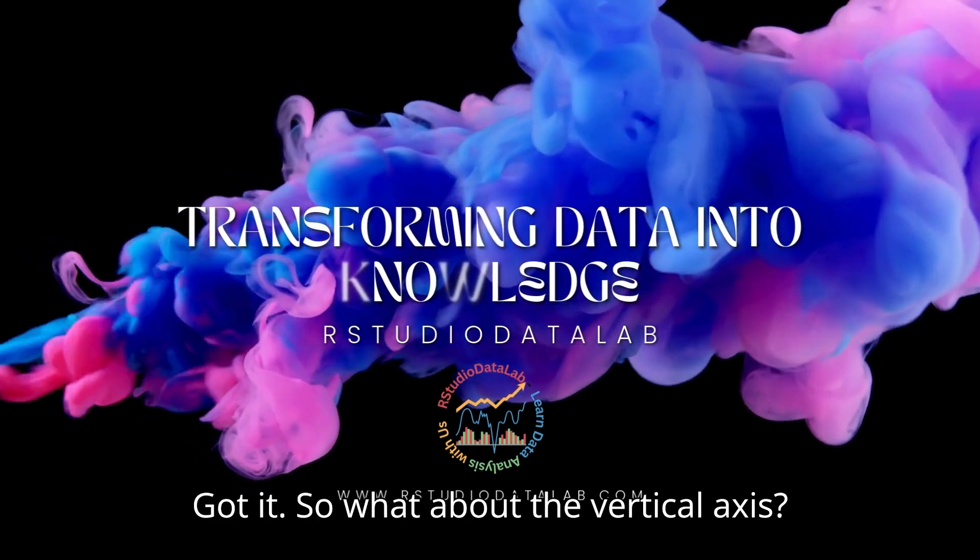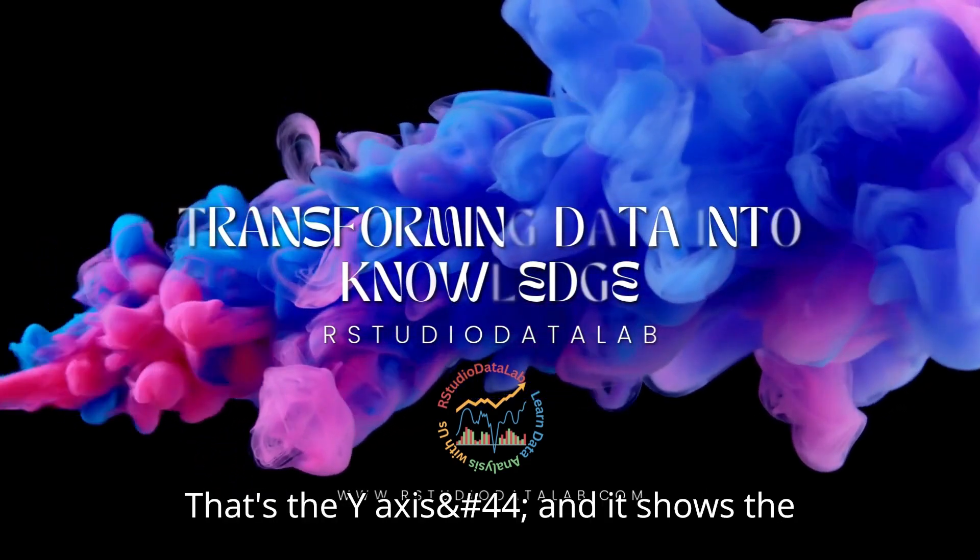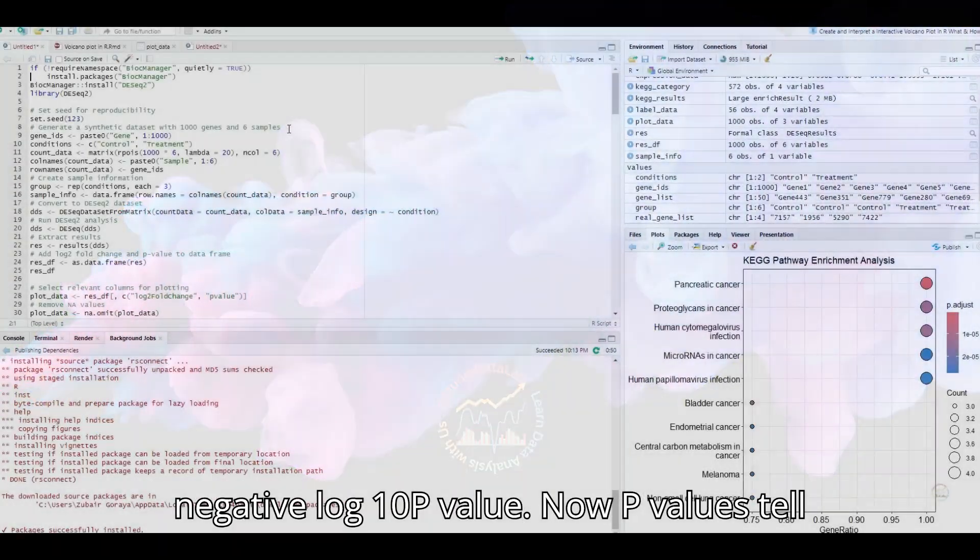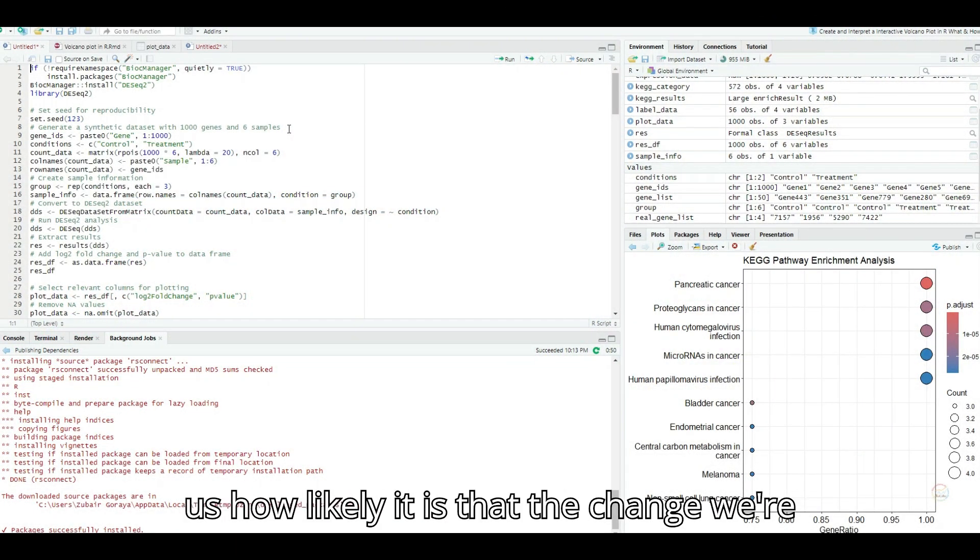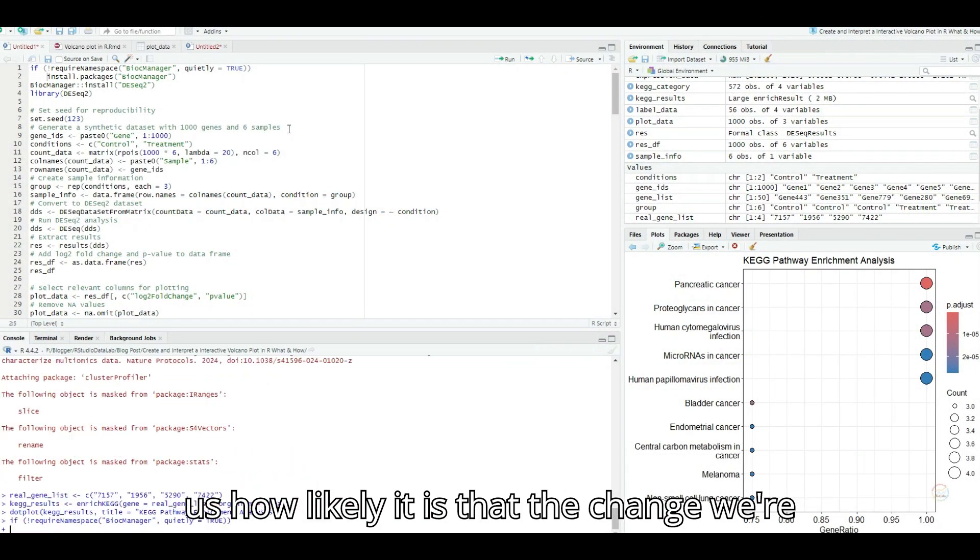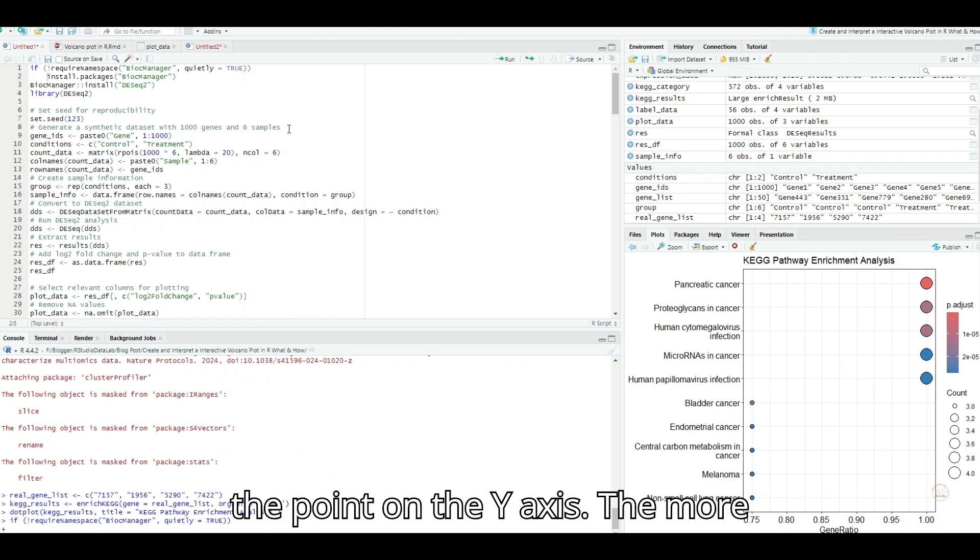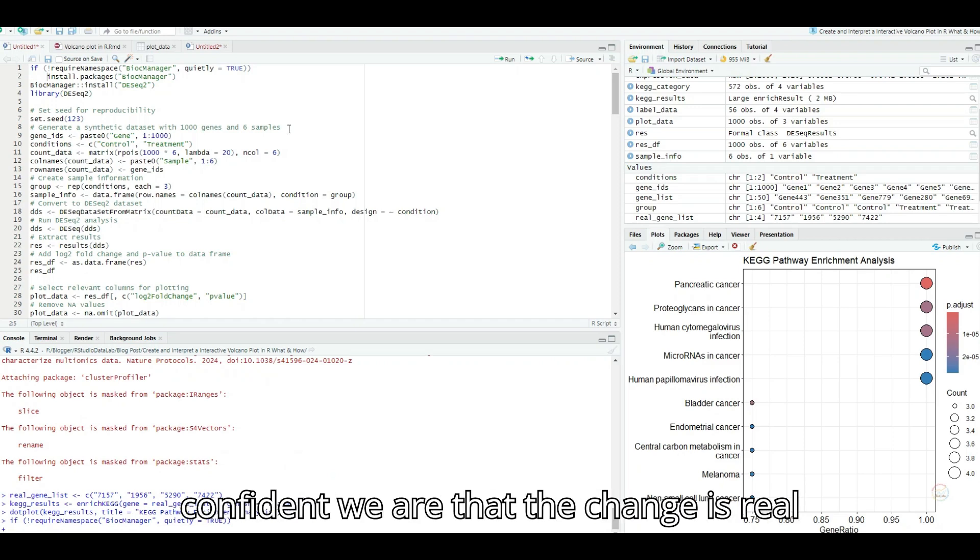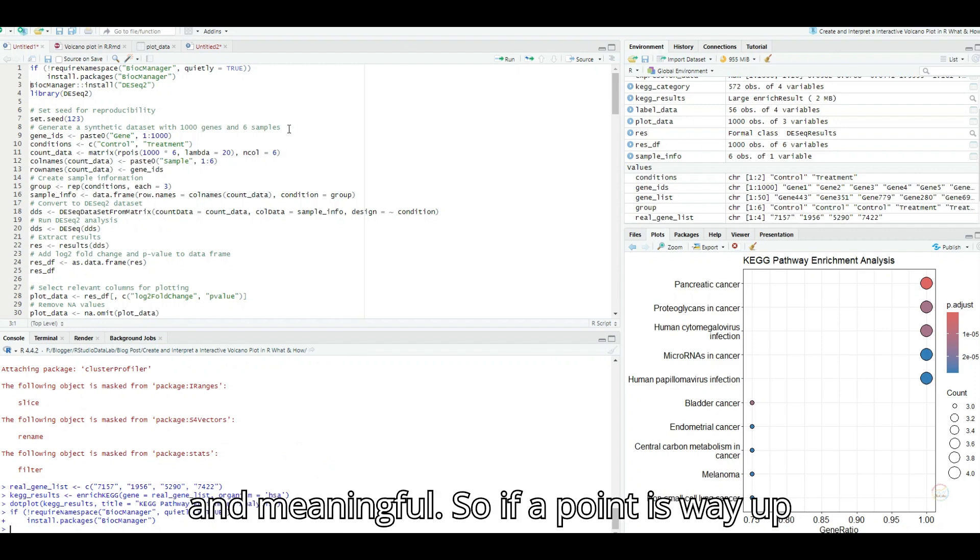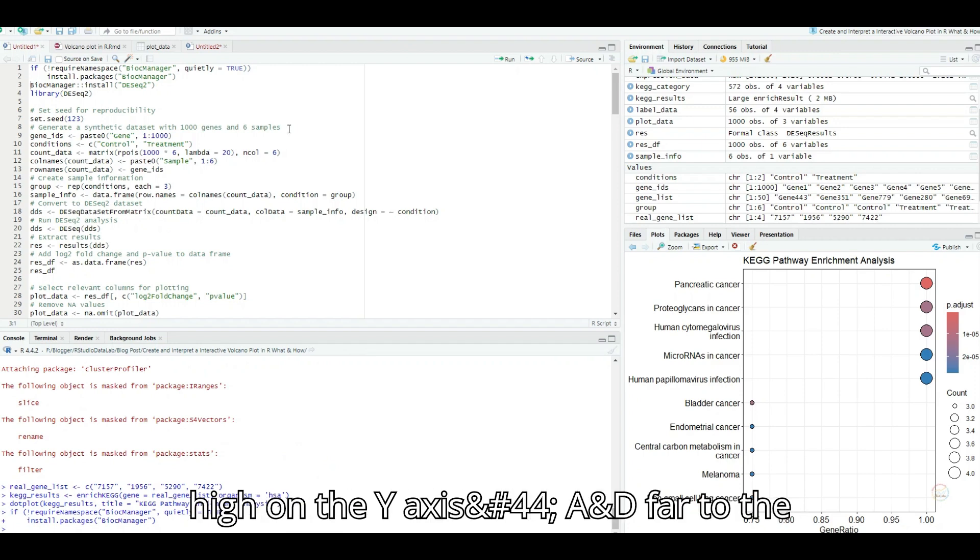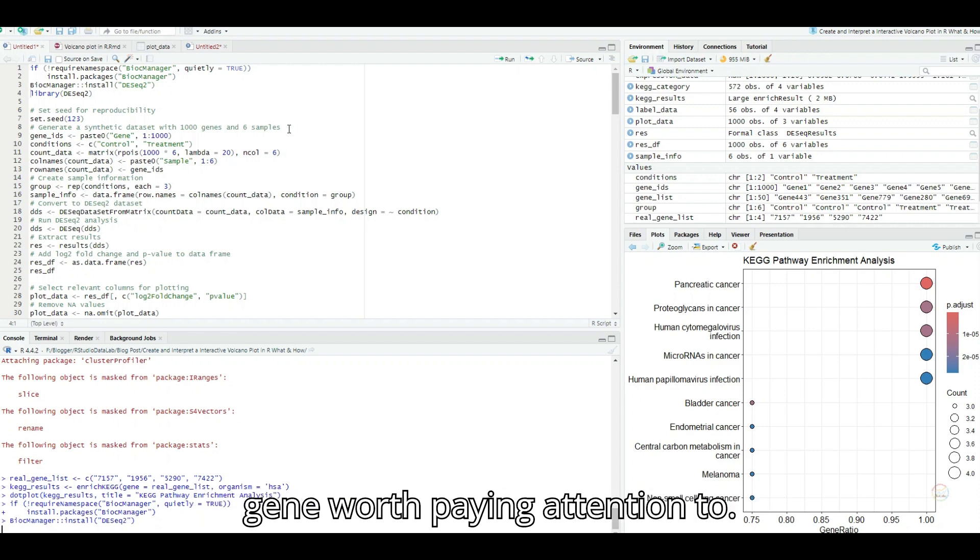Got it. So what about the vertical axis? That's the y-axis, and it shows the negative log 10 p-value. P-values tell us how likely it is that the change we're seeing is just random chance. The higher the point on the y-axis, the more confident we are that the change is real and meaningful. So if a point is way up high on the y-axis and far to the right or left on the x-axis, that's a gene worth paying attention to.